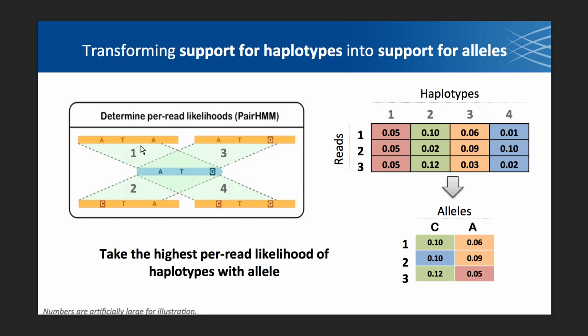So what we want to do is go from haplotypes to events, right? Because each haplotype can vary from the reference in more than one way, potentially. But in the VCF, we need to enumerate events that happen at a site-by-site level. So for example, for the haplotypes that we're looking at here, we're showing the bases that match the reference in red, and we're showing the bases that are different with a red box around them and a white letter.